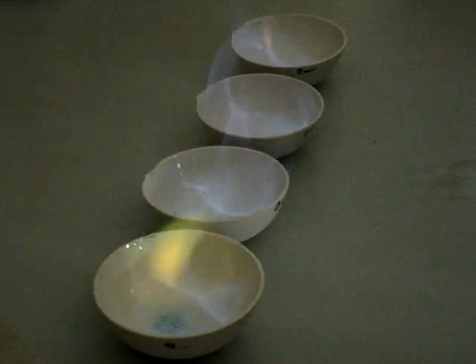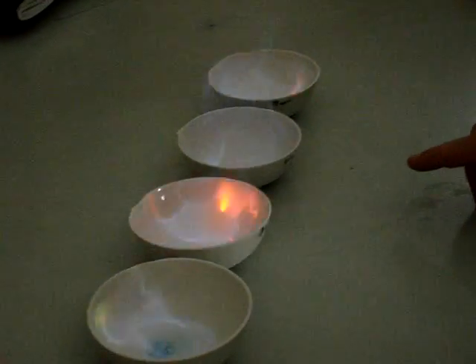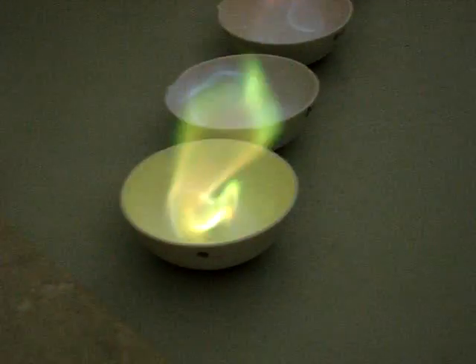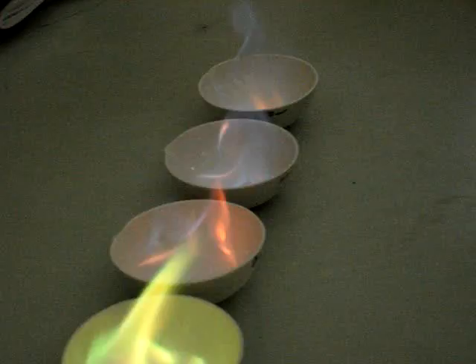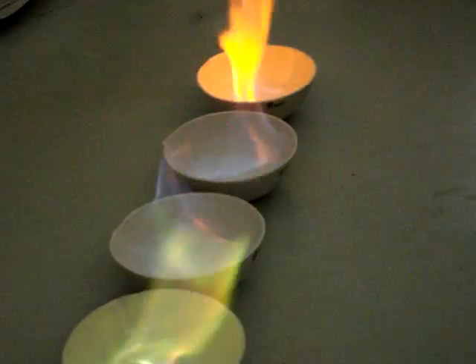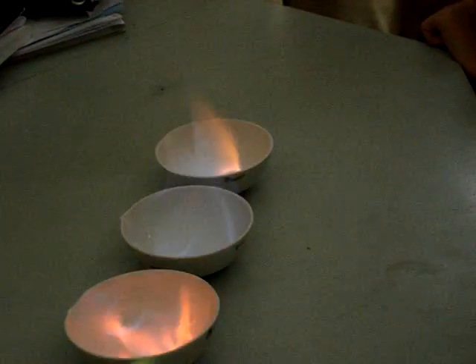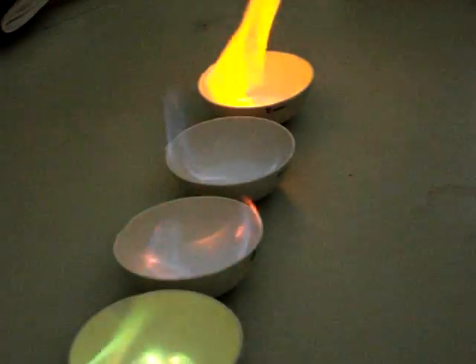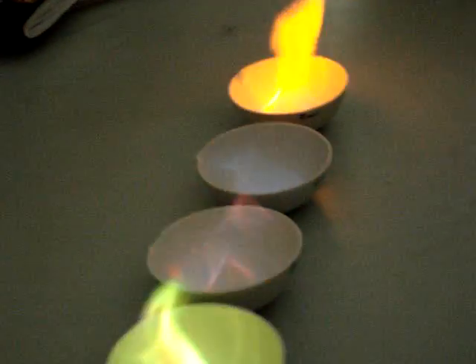I don't see anything. Ooh! This one should be orange. This one should be more purple. Let's see as it goes down. This one's going redder. Maybe that one's sodium. That one's orange. That should go purple then. It's purple. This is so cool.